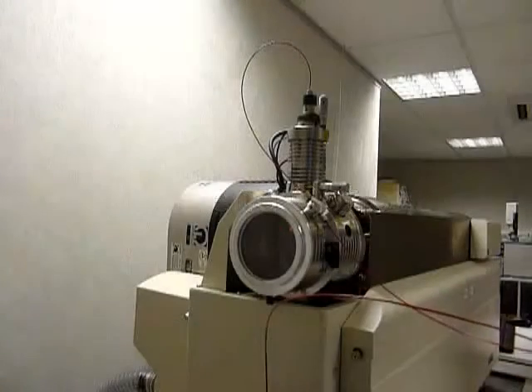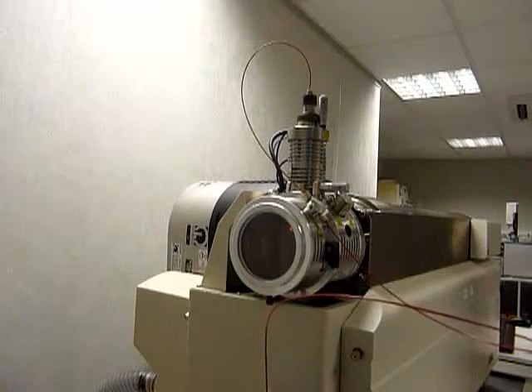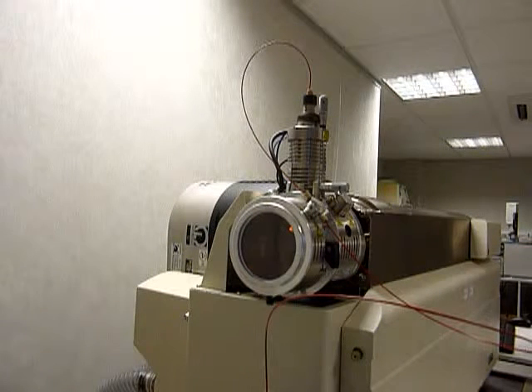The ATI-4000 comes with two ion source options: the turbo ion spray, which is what we have here — a type of electrospray ion source — or the APCI, atmospheric pressure chemical ionisation, which is another option. Simple to change: you pop one probe out, you put the other probe in. It's their so-called plug-and-play ion spray source, which can be supplied at an additional cost.